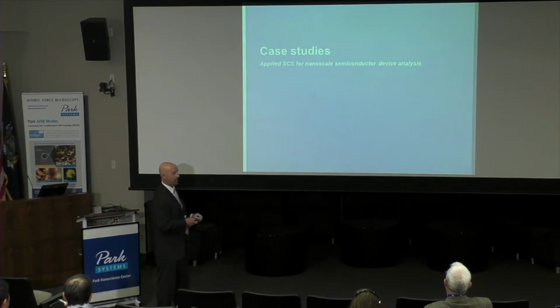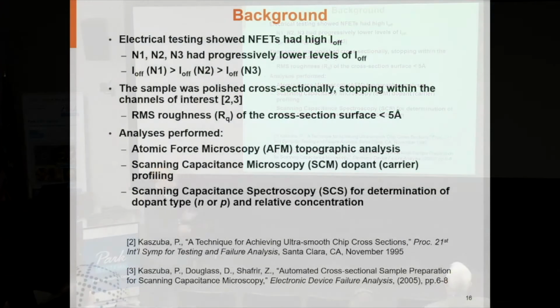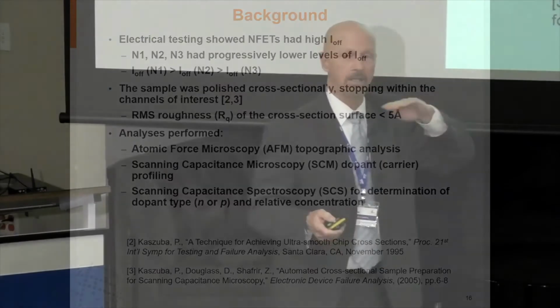Let's look at a couple of case studies. I'm going to give a couple examples, one on a planar device and one on a three-dimensional FinFET. So just a little bit of background for the first example. It's pretty amazing what these devices go through in an analytical lab, especially in failure analysis. The device will be taken from fully packaged and systematically delayered, layer by layer by layer, to get an understanding of where an anomaly or failure mechanism may exist.